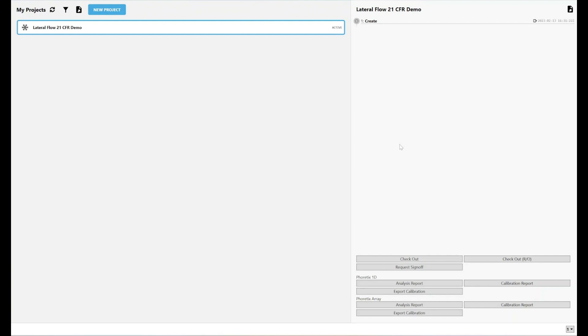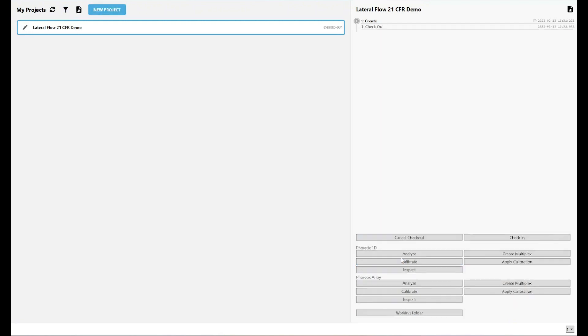If I want to do any work on that data, do any analysis, I have to check it out into a working folder on my computer that can be manipulated and edited before it's checked back in. First thing I want to do is check out the project. I've got two of my TotalLab Software products plugged into my 21 CFR solution here. I've got Phoretix 1D and I've got Phoretix Array.